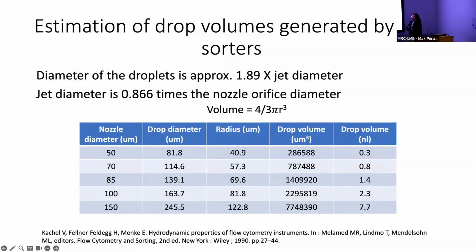So this is, of course, probably quite important for certain downstream experiments where you require very low volume generated, in particular any kind of single cell experiments, RNA sequencing experiments, or 10x experiments where you want the volumes to be very low. So we can calculate this and control this vis-a-vis both the nozzle size, the nozzle diameter, and of course the frequency which we use.